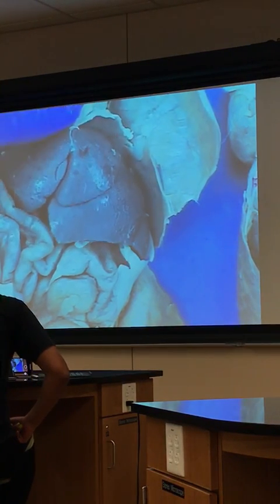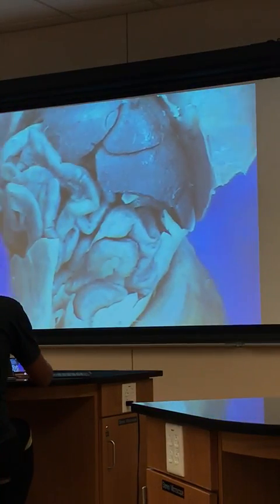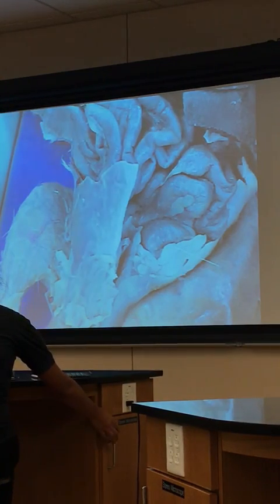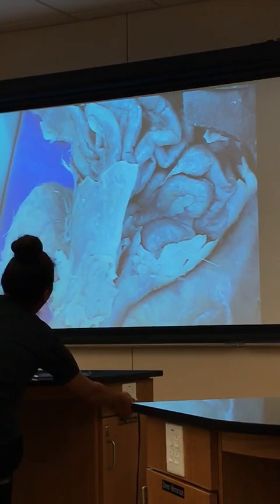Right. And I'll go back and we'll do some more of the heart stuff. So what we'll do on Tuesday, Thursday next week is take a look at the heart. Right, we'll take a look at some blood vessels.